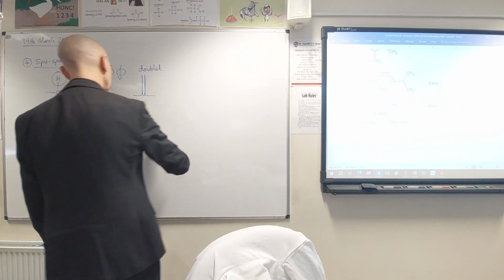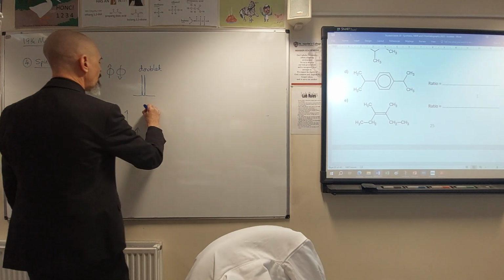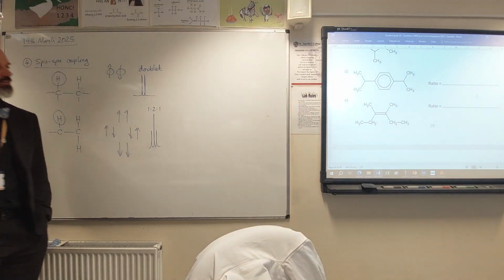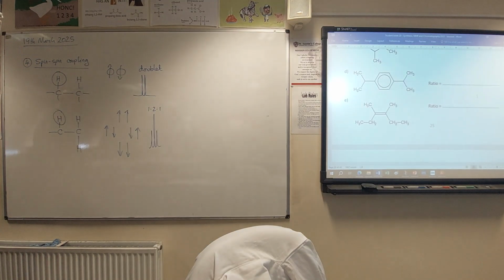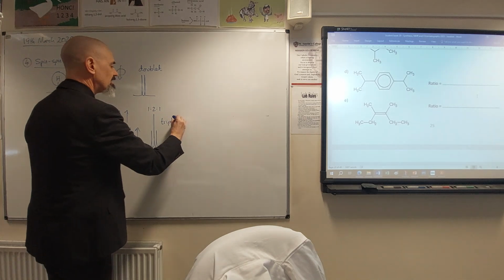So we end up with three peaks in a 1:2:1 ratio, and that is called a triplet.